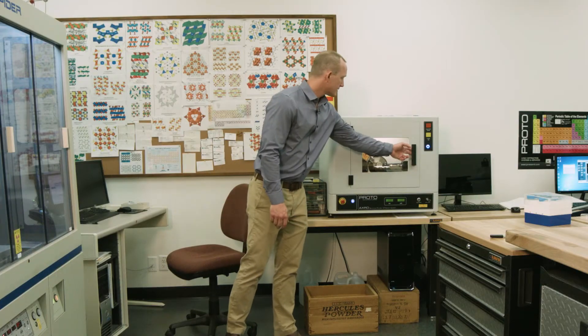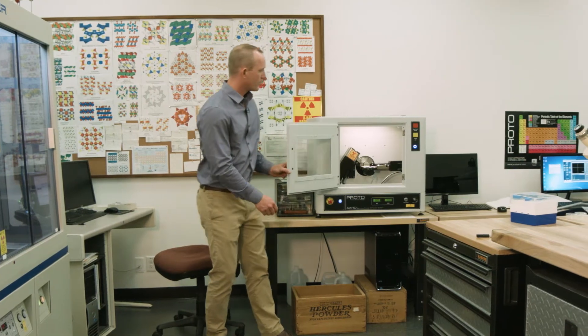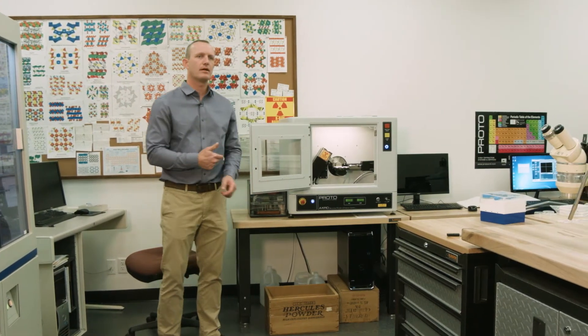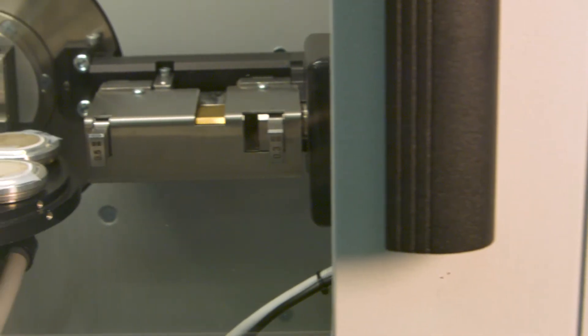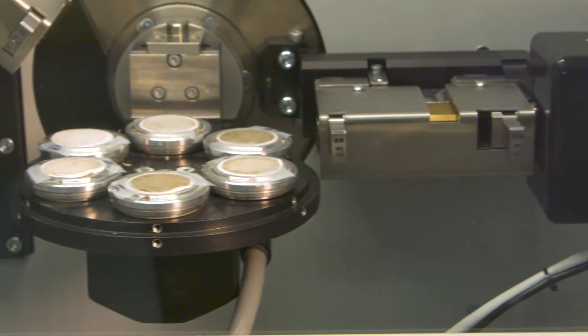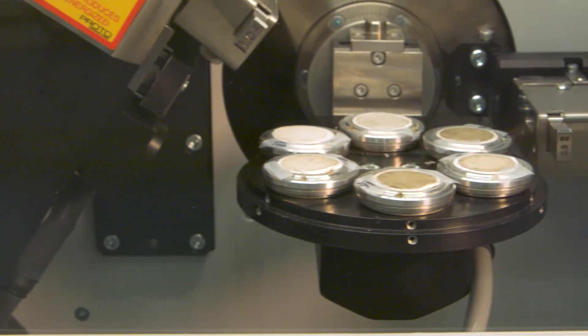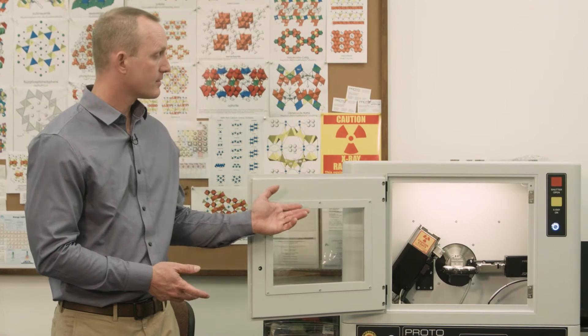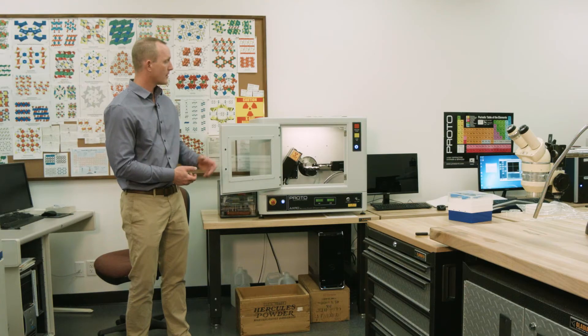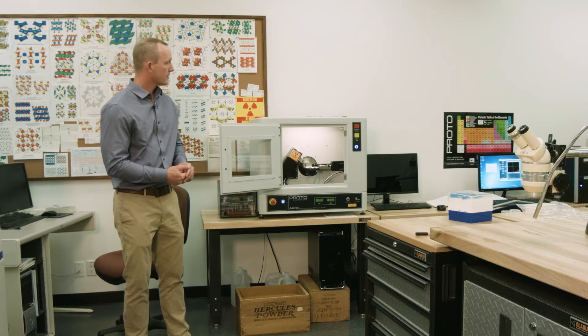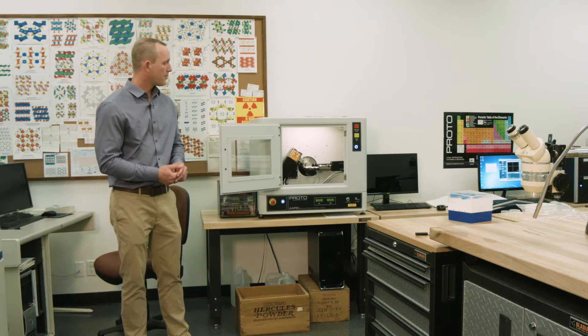The instrument on the left is one type of diffractometer where we can load many samples and have data automatically collected over time. When we come back we have a lot of data to analyze quickly. We do lots of different things with this instrument - for example, the materials loaded now are from alpine glaciers in the Peruvian Andes. We're looking at how minerals contribute to rapid glacial retreat, doing environmental mineralogy.